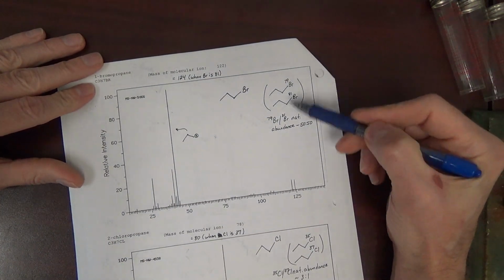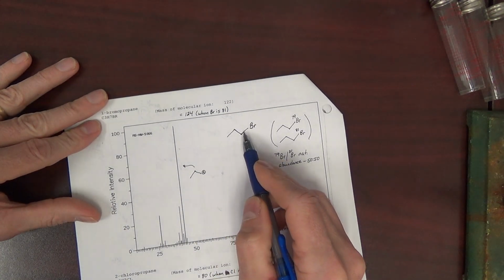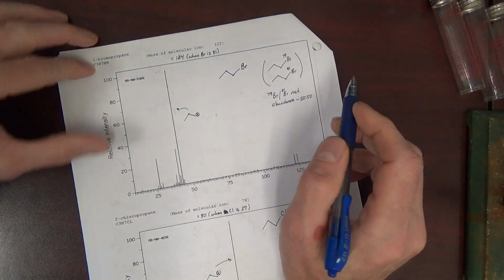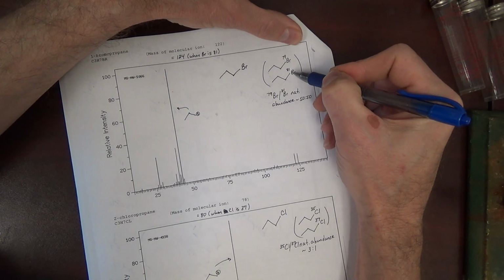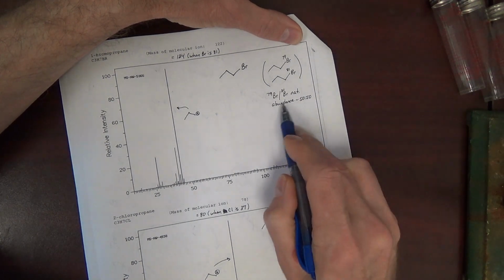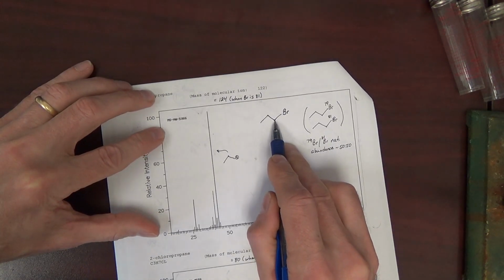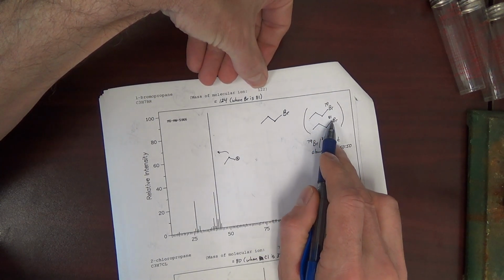Okay, let's look at compounds with some halogens in them. This molecule. First thing we need to know here is with bromine or chlorine, these two halogens have common isotopes. Bromine can either be 79 or 81. Okay? And the natural abundance for these two isotopes is about 50-50. Thus, the molecular weight for this compound, you have to use both isotopes, not an average.